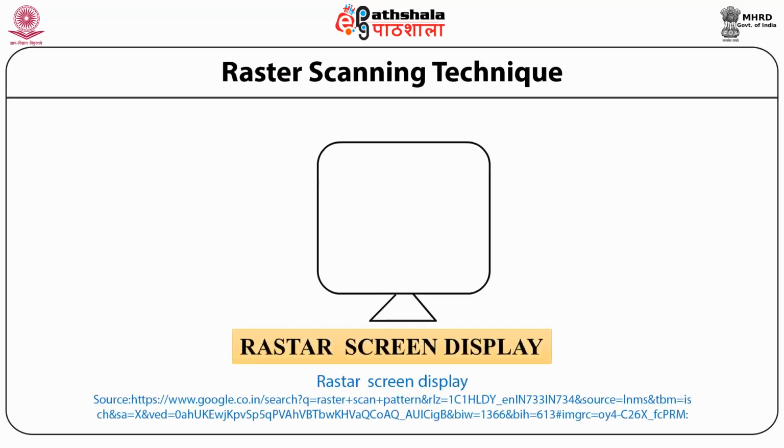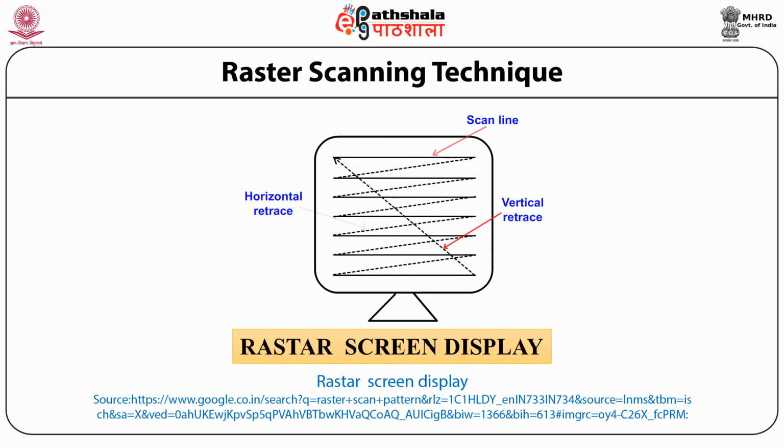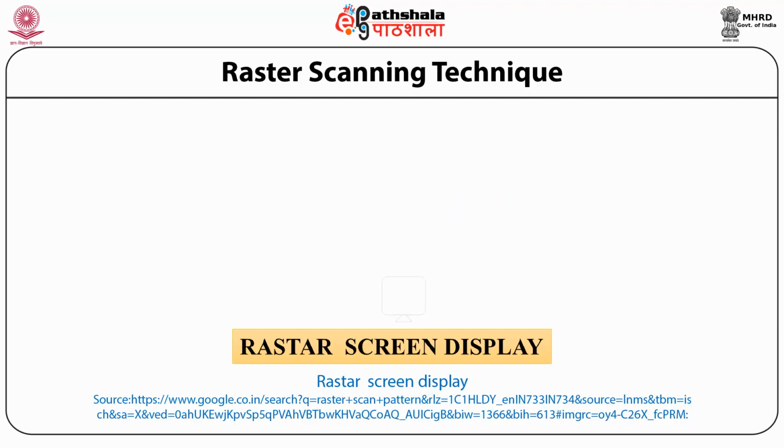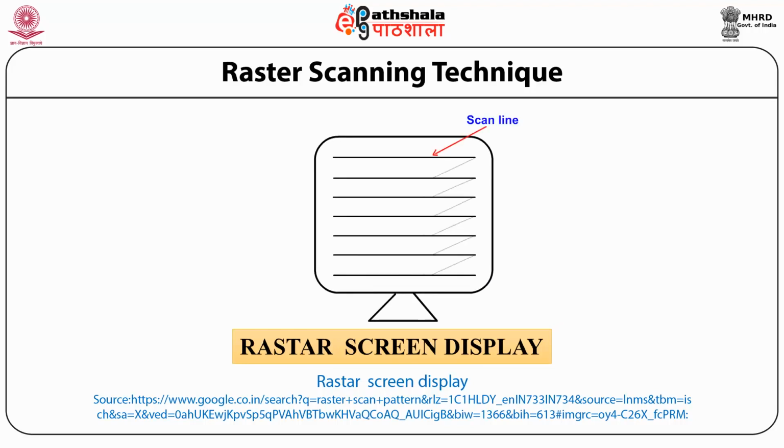A raster scan or raster scanning is the rectangular pattern of image capture and reconstruction in television. The term is used for raster graphics, the pattern of image storage and transmission used in most computer bitmap image systems. The word raster comes from the Latin word rastrum, or a rake.